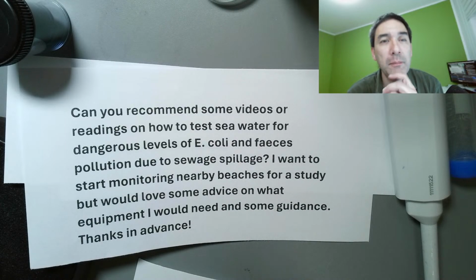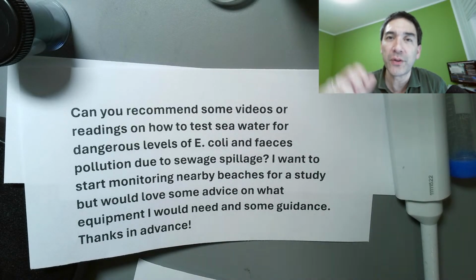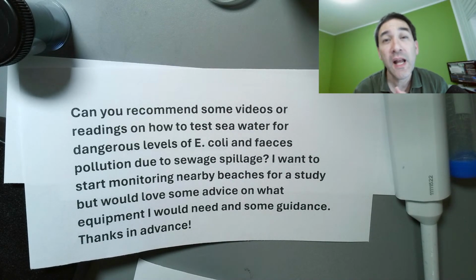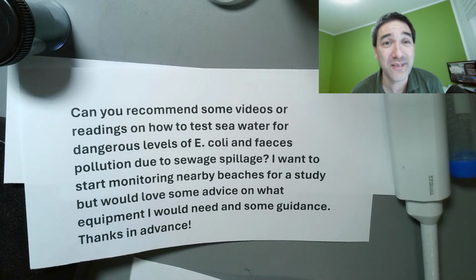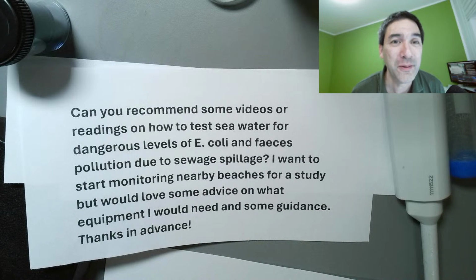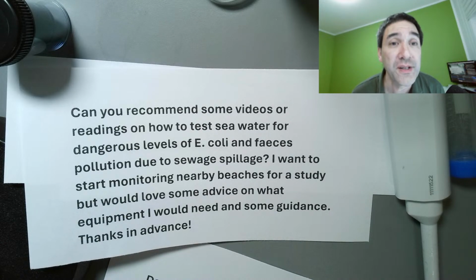Yeah. So what I've done in the past once, and I might think about reintroducing this, is indicating the objective that I've used. So, for example, I used the 10 times or 20 times objective. Having said that, whether it looks similar under your microscope depends, of course, also on the field of view of your camera, right? So this is also something that has to be included here. To compare size, I always have two slides next to each other, one with a human hair so that I can have an immediate comparison. Yeah, that's also possible, to have some kind of a reference.